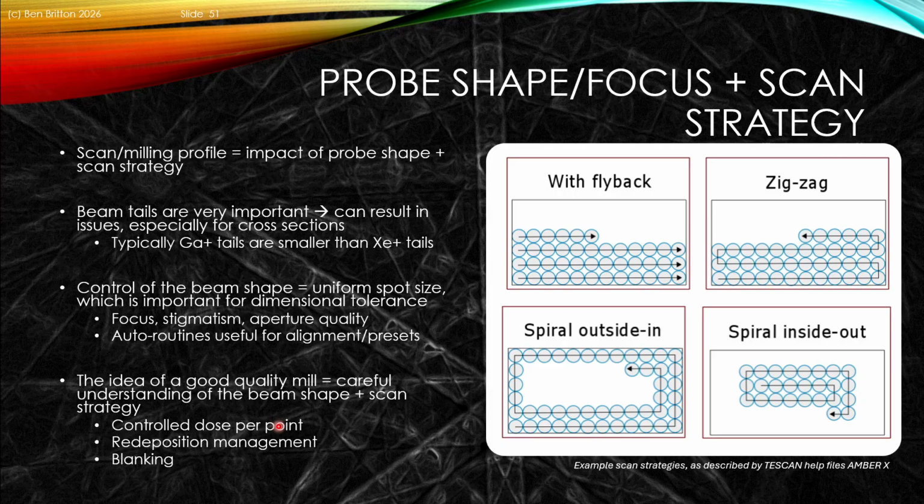And you can imagine that could change how the ejected material is built up and scattered, and that can change how fast you cut through the object. This is really controlling that redeposition process in that system, and some of this is going to be the use of very, very fast beam blankers to help you to manage this as well as possible.